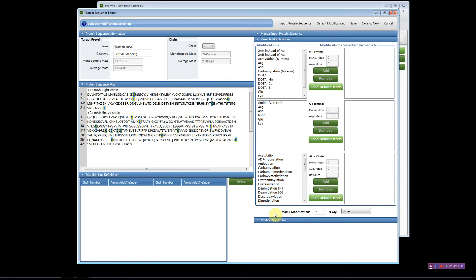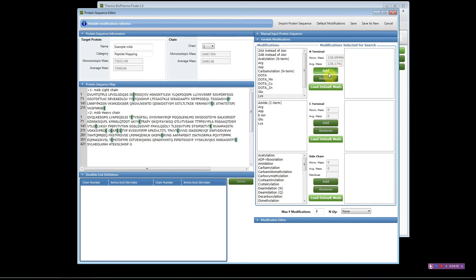Next, after adding static modifications, you may want to add variable modifications. Come to the variable modification section — the software has some defaults. This is divided by different locations on the protein sequence: N-terminus, C-terminal, and sidechain sections. You can add modifications by clicking Add, and whatever is on the right-hand side will be used for searching. Click to remove as needed.